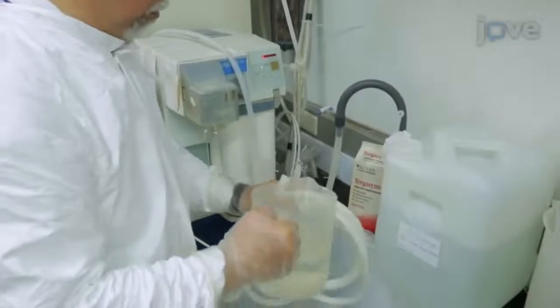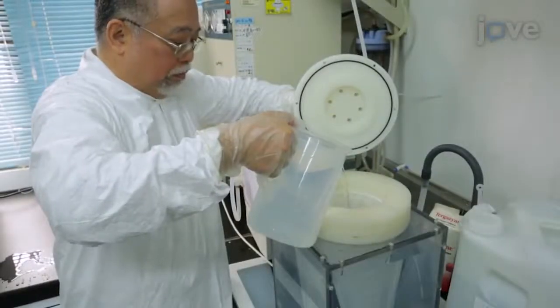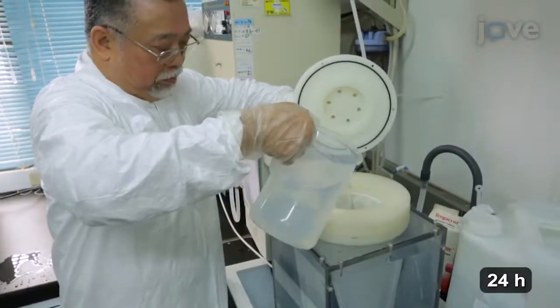First, clean the sampler. Fill the tubing and filtration unit with 1% anionic protease enzyme detergent, and let it soak for 24 hours.